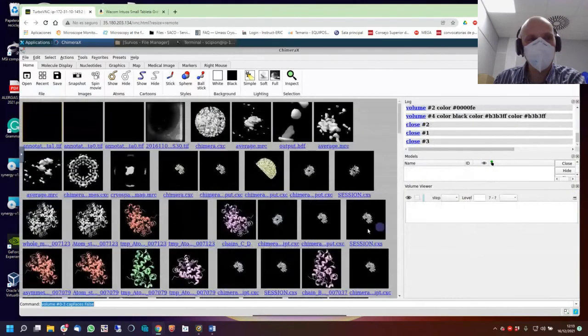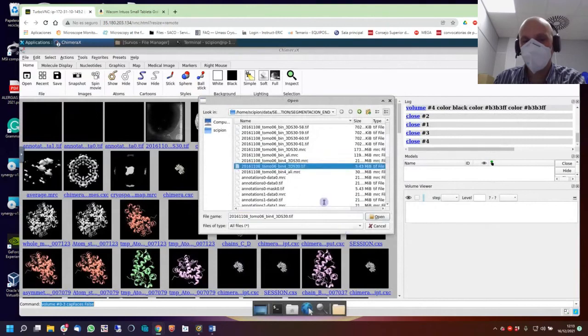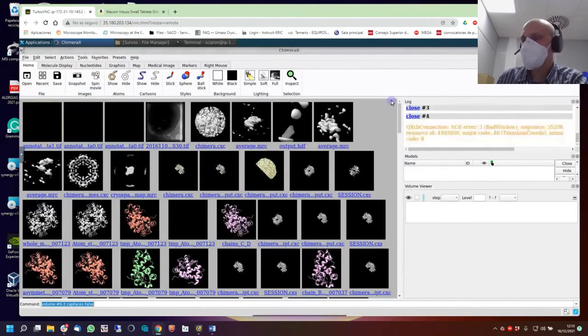Okay. Open. Let's start with the tomogram. Let's try to go for it, for example. Sorry, I'm still in the process of closing everything. Okay. Okay, because I'm not familiar with Chimera at all. That might be the problem today.